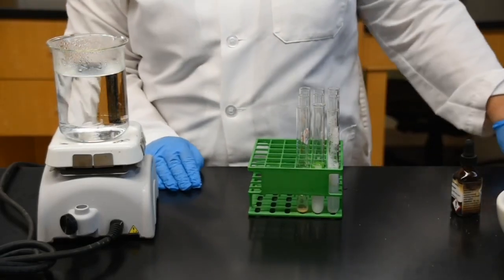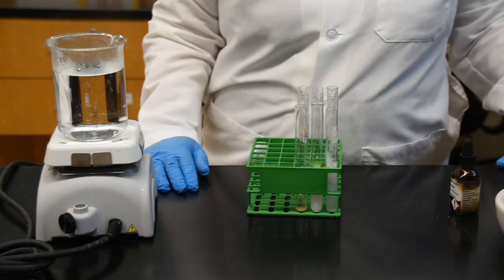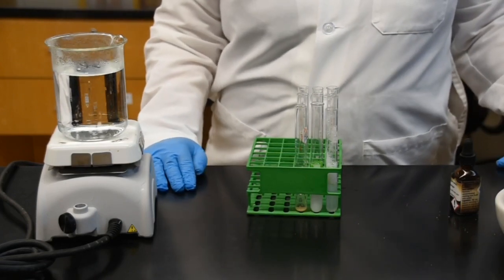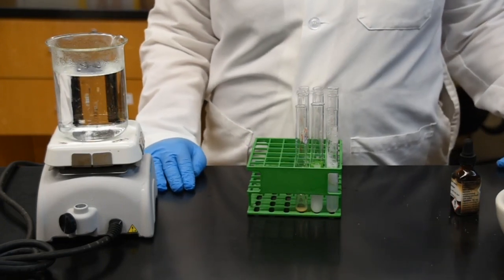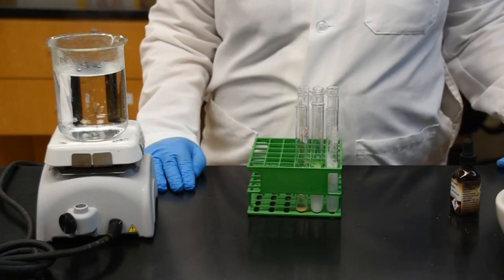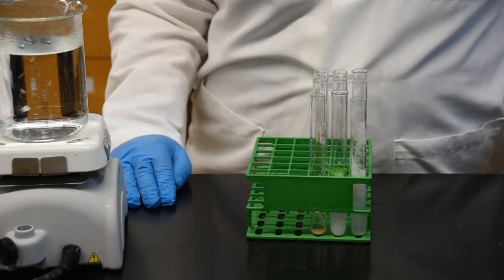Okay guys, so today we're going to take a look at some of the food samples that you guys consume and see what type of macromolecules can be found in these foods. So we know that there are 4 major organic macromolecules in our food. They include your carbohydrates, your fats, your proteins, and your nucleic acids, which are basically your DNA and RNA.